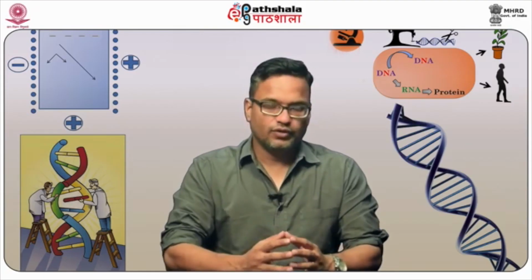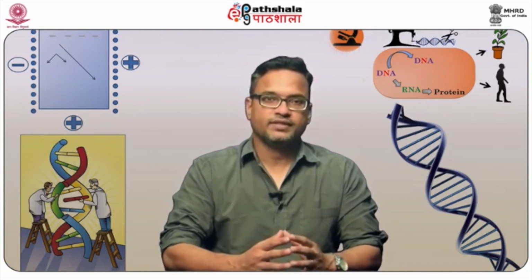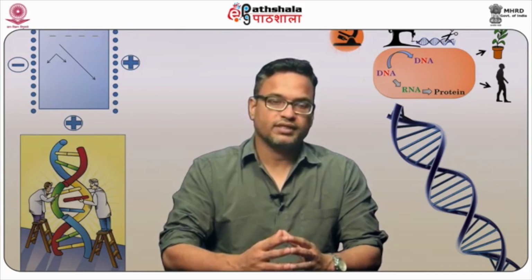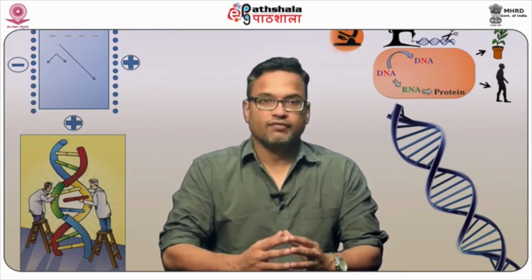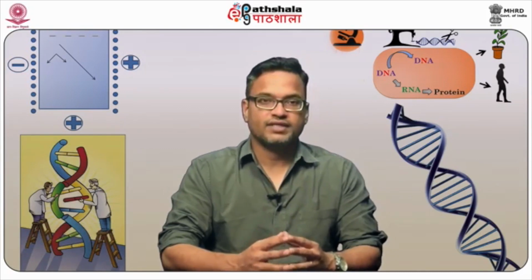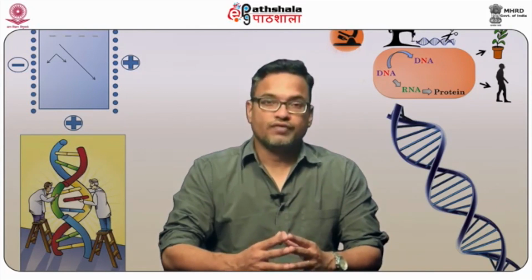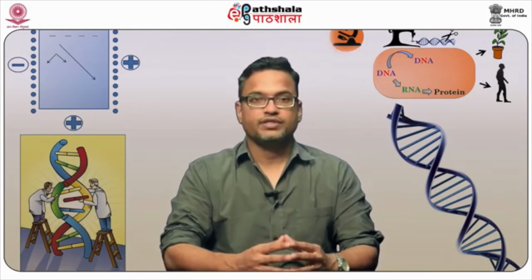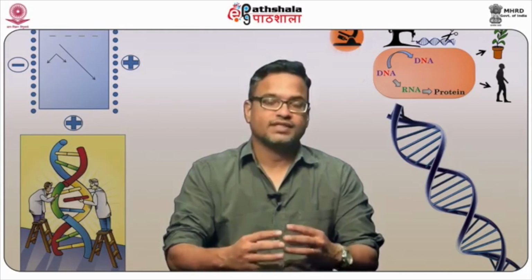By the end of this module, I hope students have learnt about the fluorescence based imaging methods and the microscopy that has been done using fluorophores: wide field microscopy, confocal microscopy, two photon microscopy, as well as the applications of these techniques in FRET, FRAP, as well as in TIRF. So wide field and confocal differ in the way the sample is exposed.